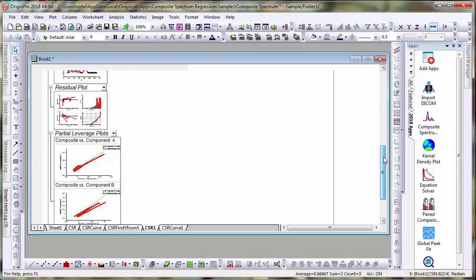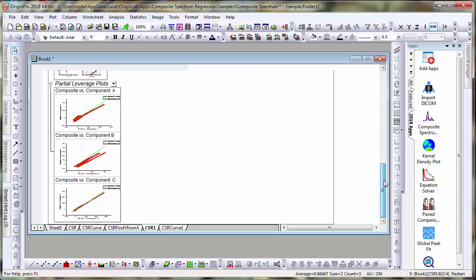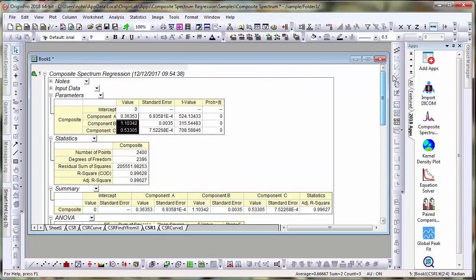The app also includes partial leverage plots as well.